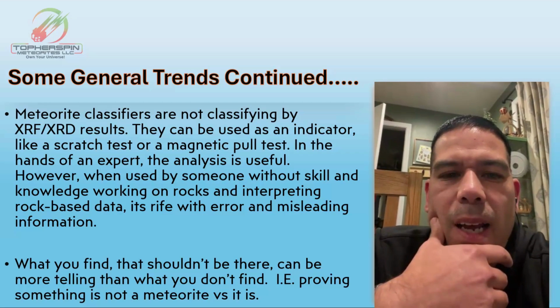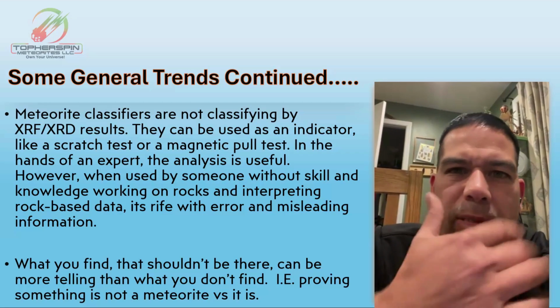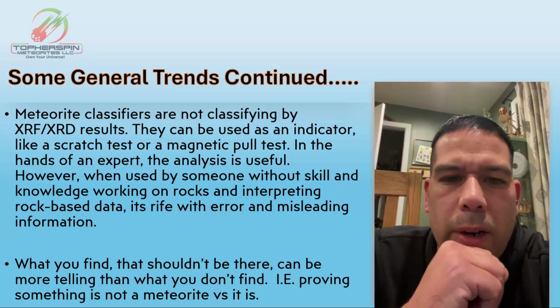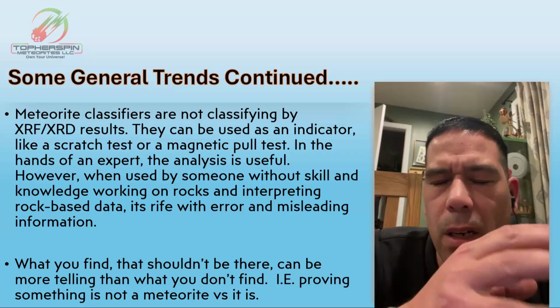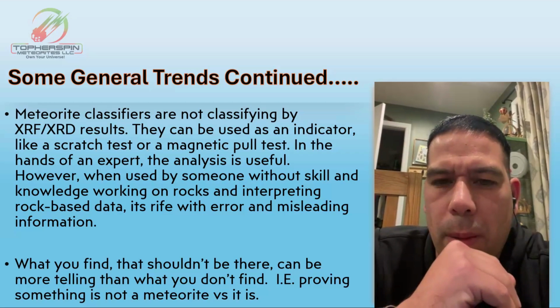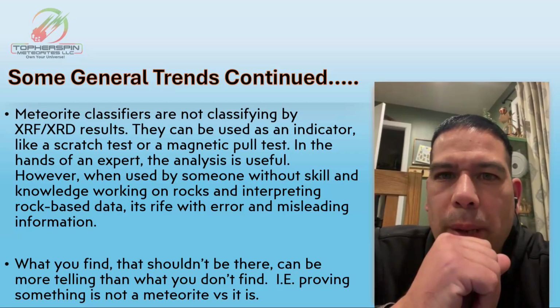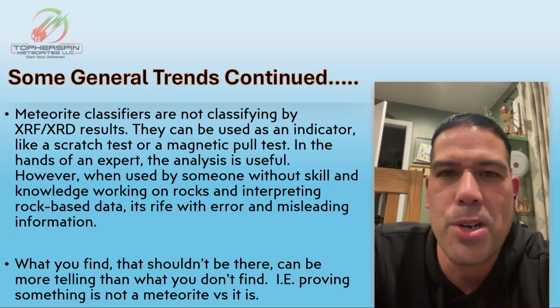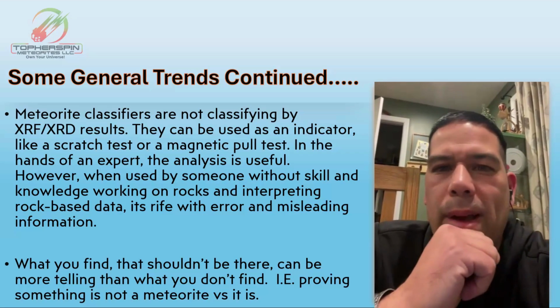Things like copper have pretty specific ranges for the chondrites, 80 to 280 ppm is where you should be hitting. So if you're hitting up in the percentages, you now have way too much, and you could basically rule out that being a meteorite. Awesome. I appreciate your information as always.